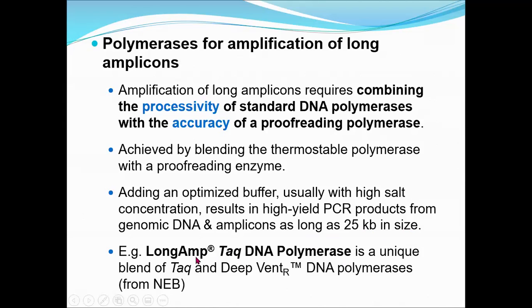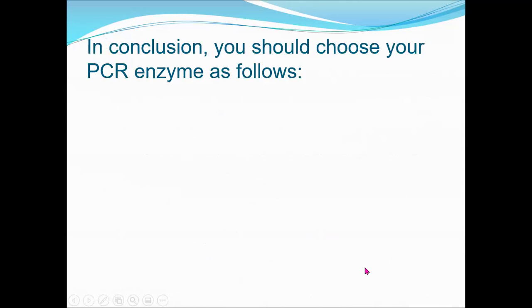The specific long amplicon polymerase is LongAmp Taq DNA polymerase, which is a blend of Taq and Deep Vent DNA polymerase from New England Biolabs.